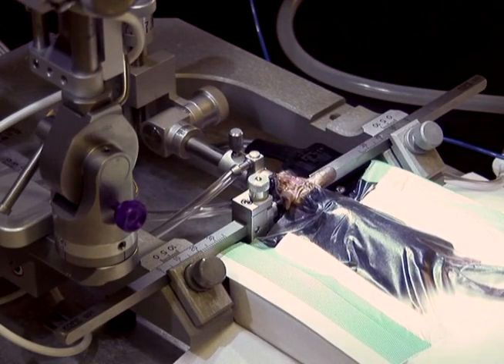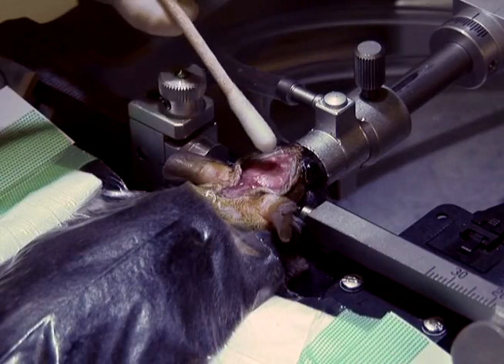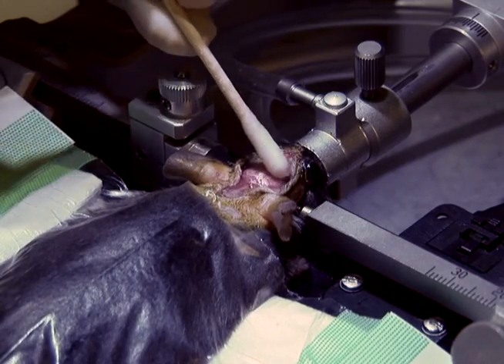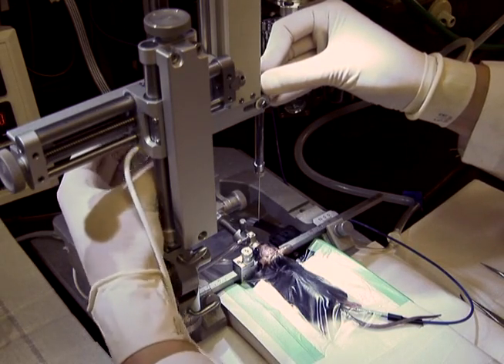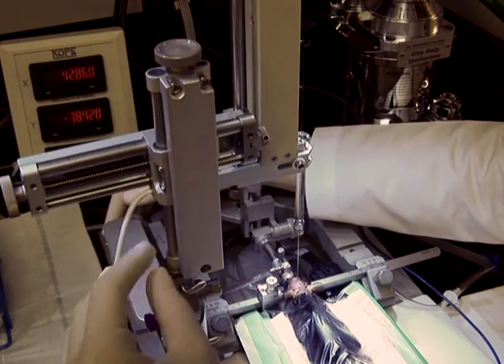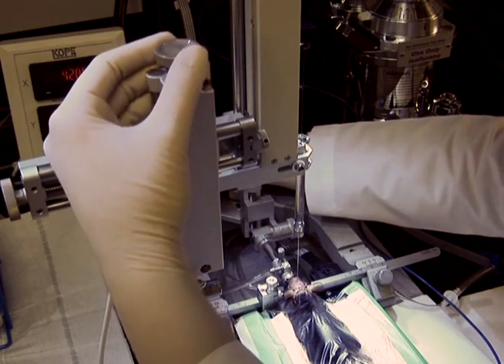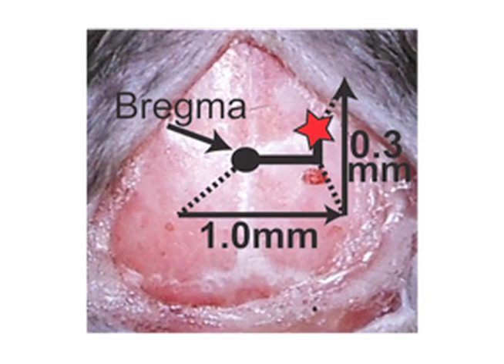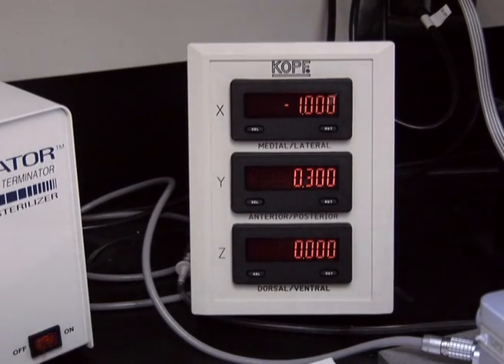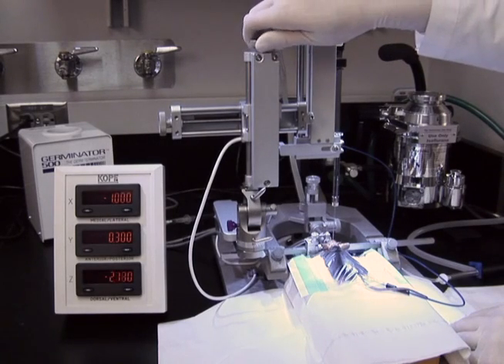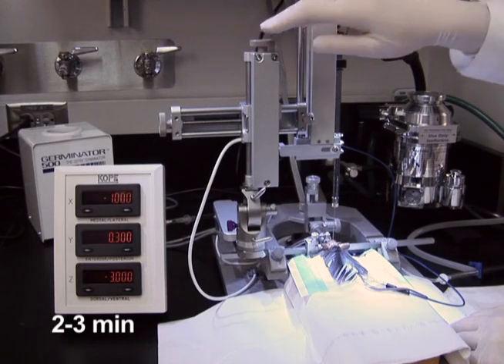To administer an intracerebroventricular bolus, a scalp incision is made as before and the skull of the animal is wiped clean and treated with hydrogen peroxide. Then, move the syringe with drug into place. Orient the beveled portion of the needle towards the posterior and secure into place. Lower the needle until it touches bregma. Zero all of the coordinates and then move the needle laterally to the right 1.0 mm and anterior 0.3 mm. Slowly, drive the needle through the skull until the top of the needle bevel is flush with the top of the skull. This can be done due to the thinness of the mouse skull. Zero the z-coordinate and lower the needle to minus 3.0 mm at a rate of 1 mm per second. Wait 2 to 3 minutes for the brain to seal around the needle.